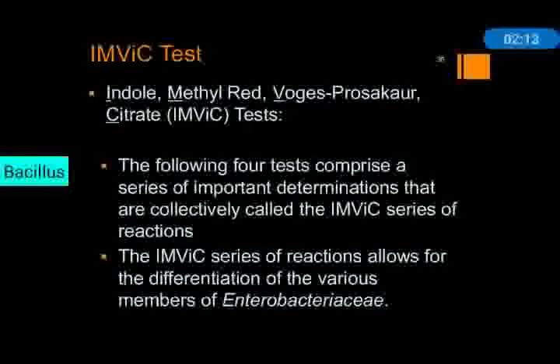First, the IMViC test. What is the IMViC test and what is the full form of IMViC? I means indole, M means methyl red, V means Voges-Proskauer and C is the citrate test. So this is the IMViC test. The following four tests comprise a series of important determinations that are collectively called the IMViC series of reactions. This IMViC series of reactions allows for the differentiation of the various members of Enterobacteriaceae.